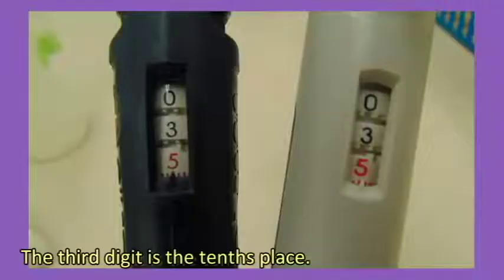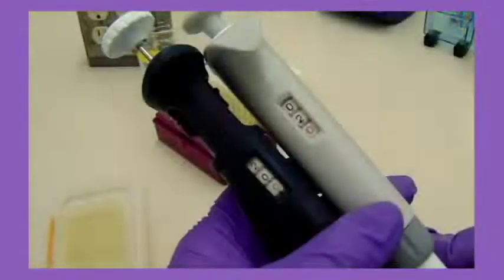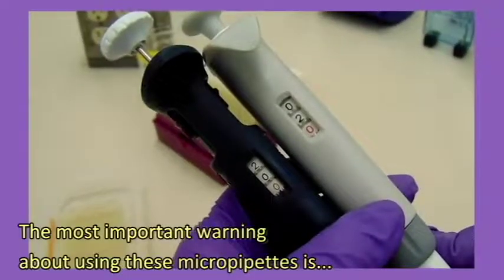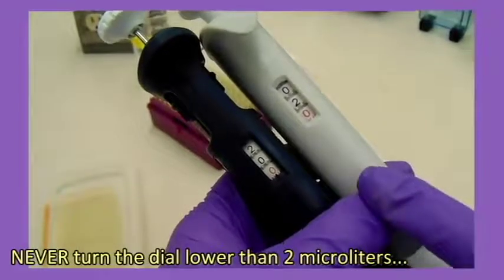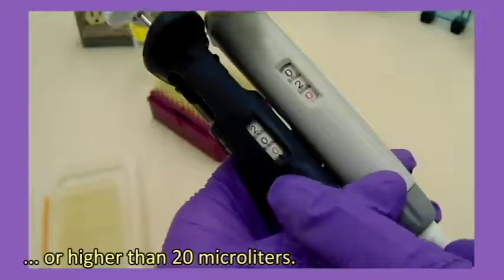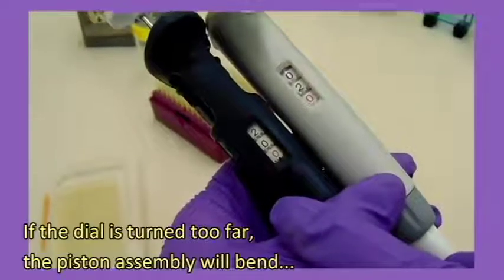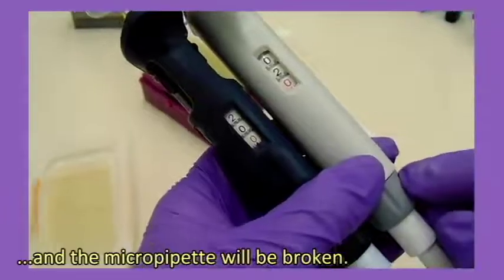The third digit is the tenths place. They've made it red to remind you. The most important warning about using these micropipettes is never turn the dial lower than 2 microliters or higher than 20 microliters. If the dial is turned too far, the piston assembly will bend and the micropipette will be broken.